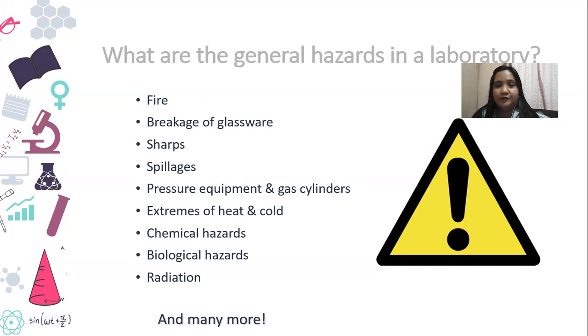Of course, it depends on the type of laboratory or the level of laboratory you have. In our case, most of the time, my experience with a laboratory class would be breakage and then sharps and spillages. Especially if it's the rainy season, you can't help but have spillages also.